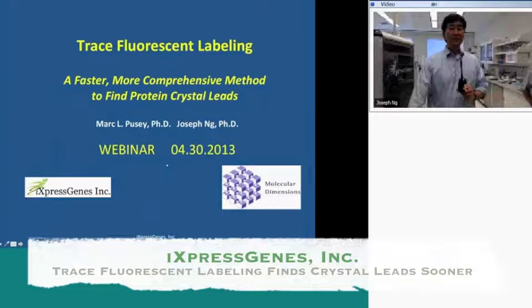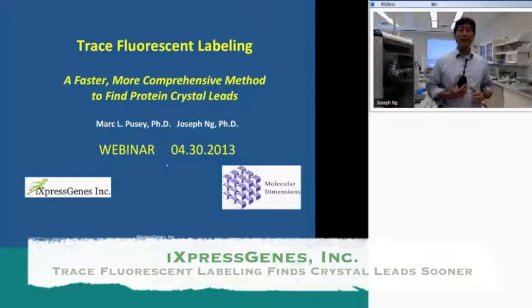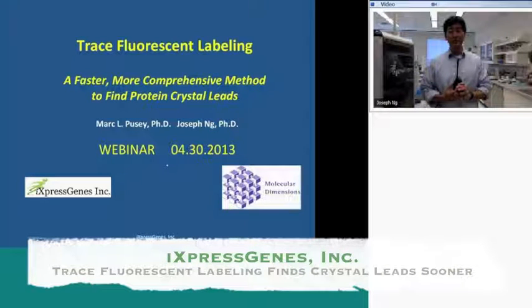So in terms of where we are at, we are building a laboratory here at the HudsonAlpha Institute in Huntsville, Alabama. This is a new biotech institute, and we're working with structural genomics. Trace fluorescent labeling came to us as a method to build faster and more comprehensive methods for early detection screening.